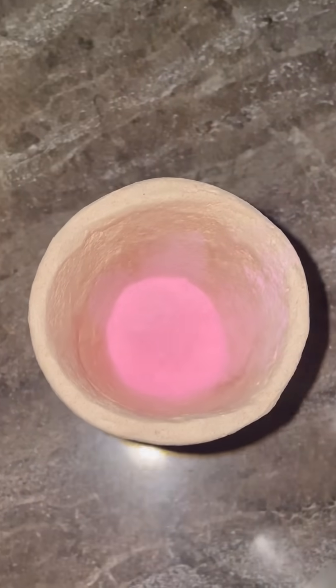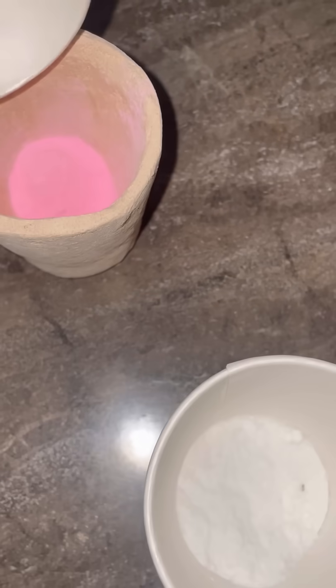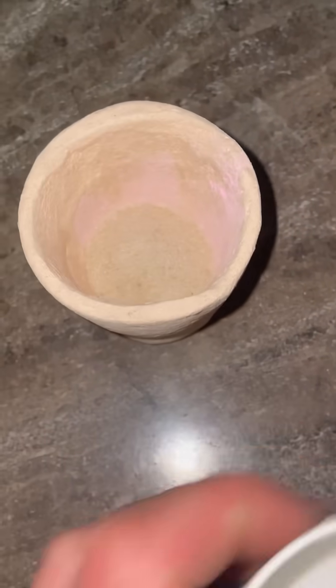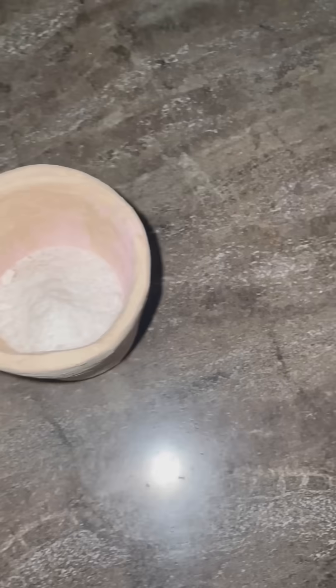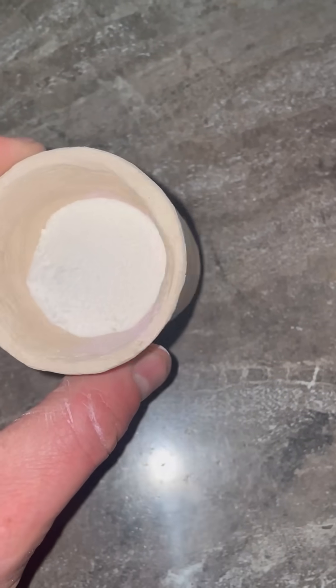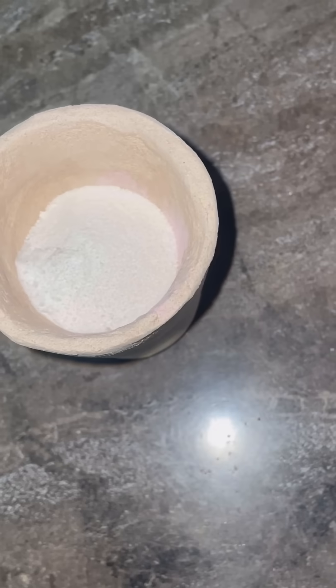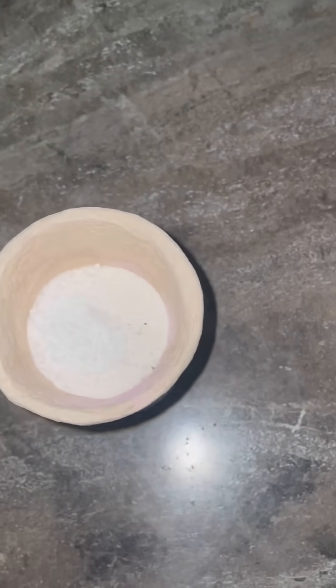That's four grams of crushed Pepto-Bismol pills. I'm going to add to that some sand — just silica sand — some borax, and some sodium carbonate. Now of course this doesn't contain any precious metals so it's not going to really show much, so let's add a tiny bit of gold powder in there, just enough to give us a bead. So we're pretending to do a fire assay here essentially.